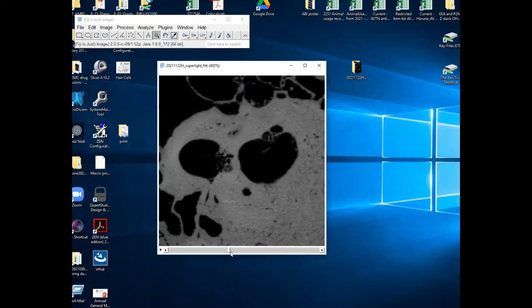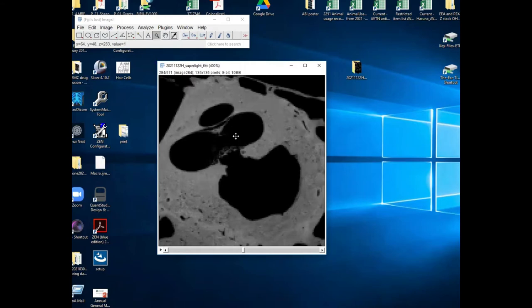Now you've got a much smaller set. It's just a cochlea. And we want to make our cochlea phantom based on this fluid filled space. So this data set could be useful for both.